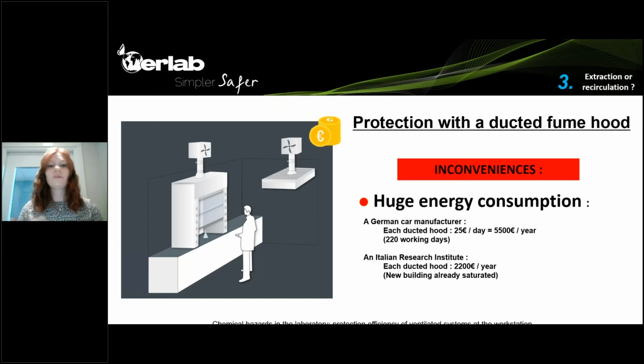Of course, it depends on the age of the building, sorry, of the age of the ducted fume hood. For instance, in an Italian research institute, the ducted fume hoods were consuming around 2,200 euros per year. But as I say, it really depends on the age of the fume hood, on the building, etc.